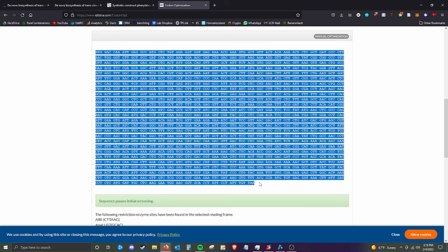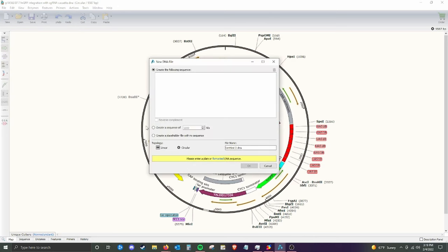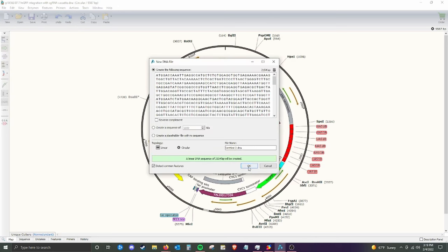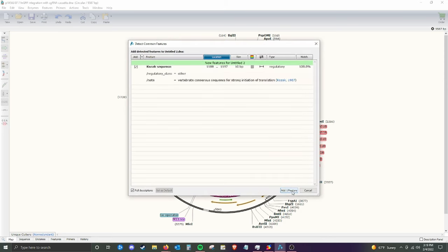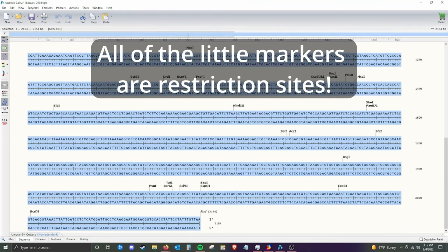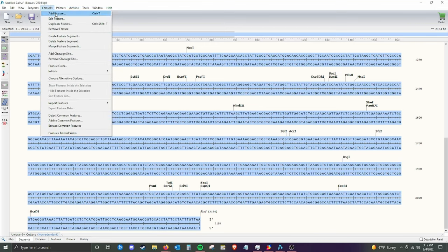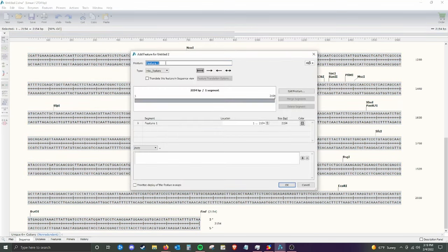Here is the result of the codon optimization. Saccharomyces and Yarrowia are pretty closely related, so the differences may be kind of small. We're going to start a new DNA file in Snapgene — a fantastic tool for doing DNA manipulations. We have the option to add some features, but we don't need those. This is our gene in Snapgene. We can actually take this whole gene and translate it into the protein, just so we can see the amino acid sequence. I'm adding a feature here, calling it ATPAL2, and making sure to translate this feature.